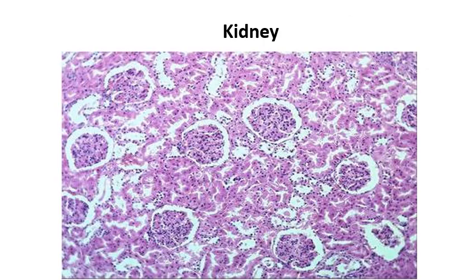The kidney is a kidney-shaped structure. It appears like this under the microscope. When you see the cortex, you can see the Malpighian renal corpuscle. Kidney.